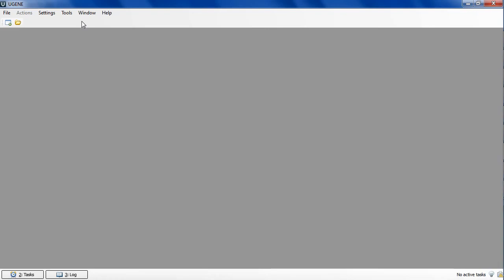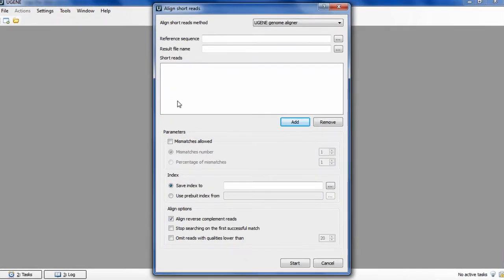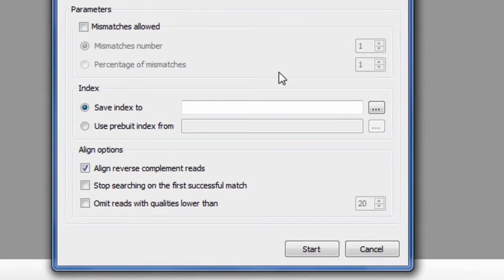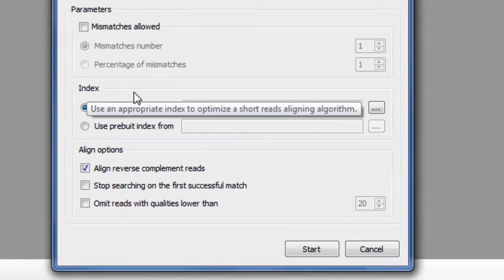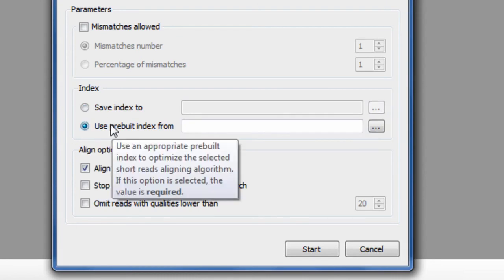Since now, UGENE Genome Aligner tool allows you to save the index file that is built for the reference sequence. Next time when you align short reads to the same reference sequence, you can use this pre-built index. This can make DNA assembly really fast.